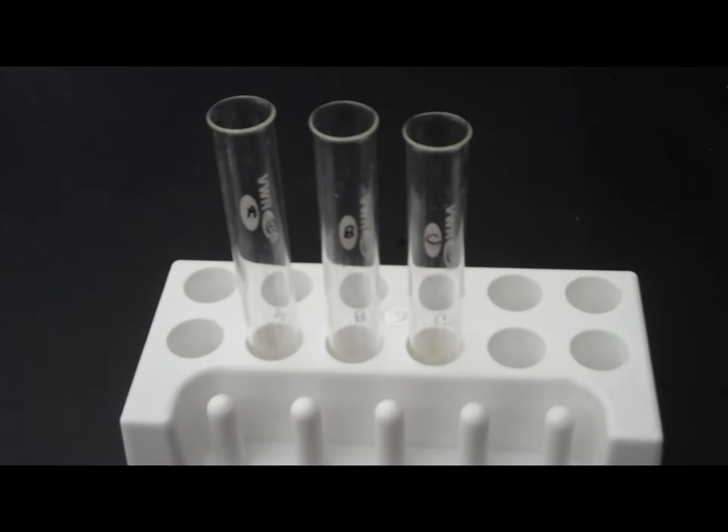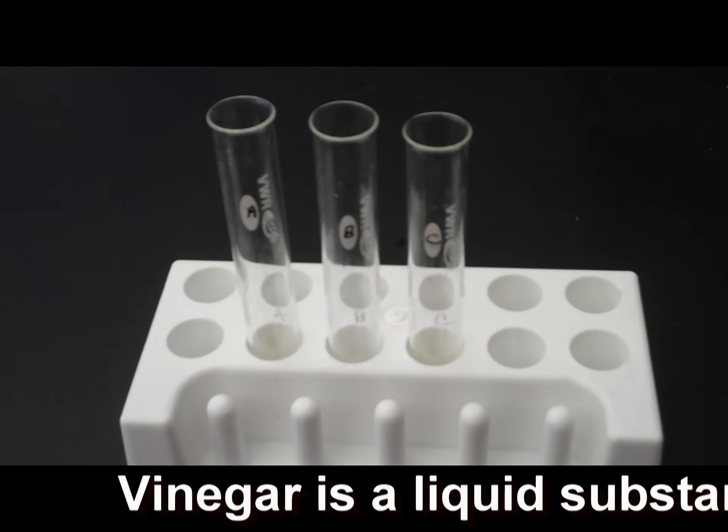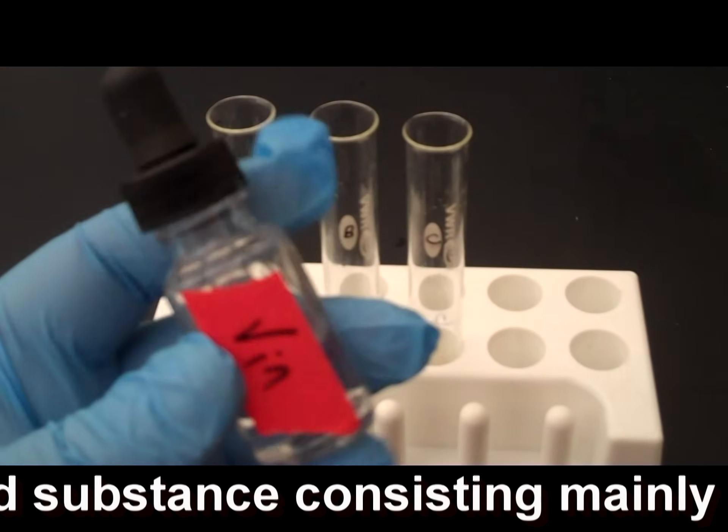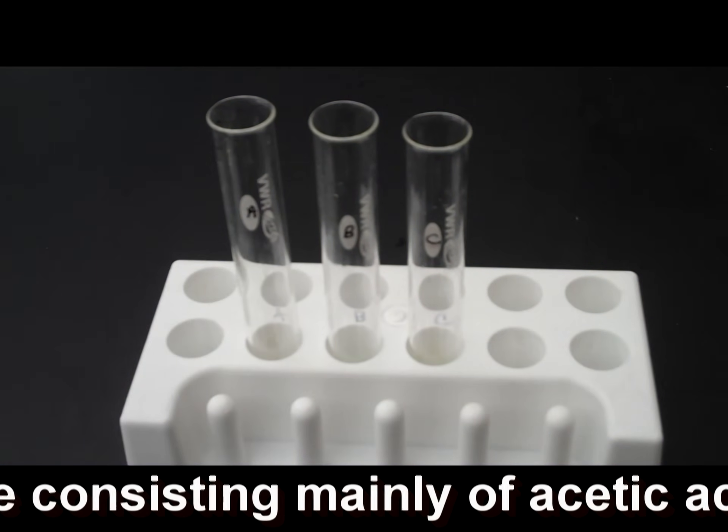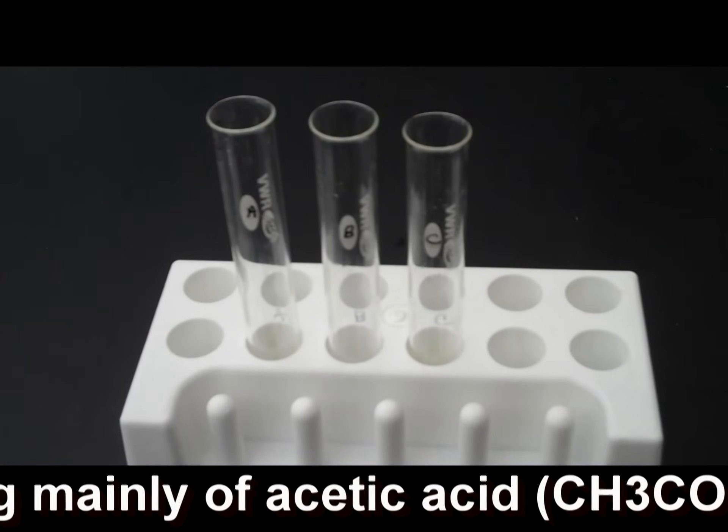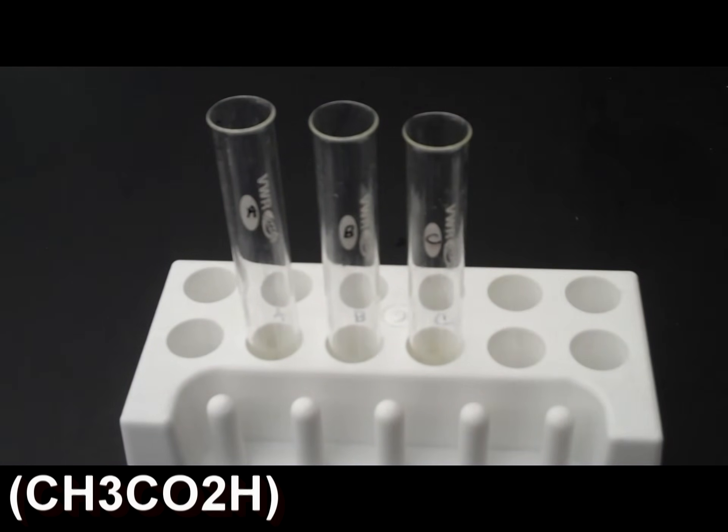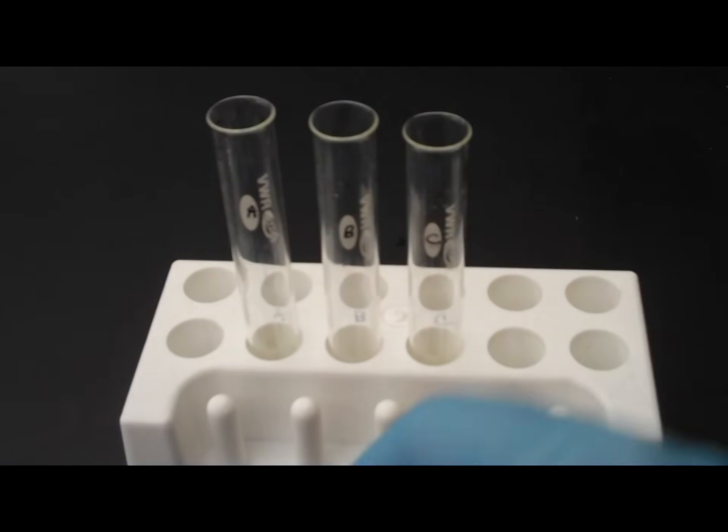The next thing we're going to add is vinegar to test tube A. Vinegar, if you remember, is a weak acid. So, we're going to see if acid affects enzyme activity. And I'm going to put two dropper fools of vinegar into test tube A. I'm going to set my vinegar to the side because we're through with that.